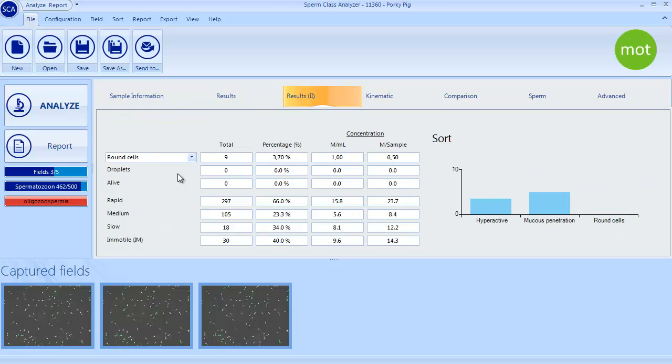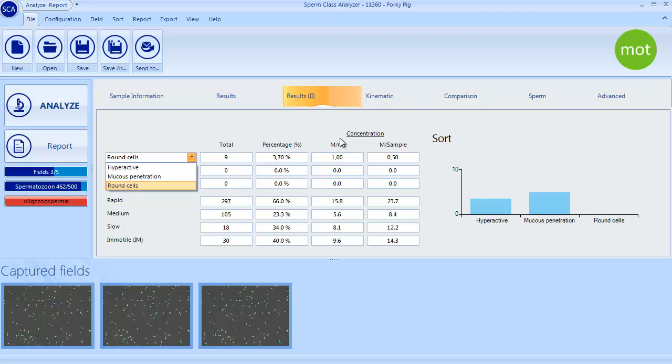Additional Results tab presents the classification of several groups created by the user as hyperactive, mucus penetration, or round cells.